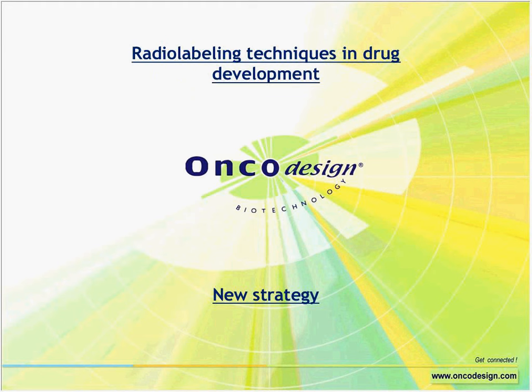So all the procedures I've shown are, I would say, dedicated to molecules that are already synthesized. And as they are already synthesized, the label will be linked, I would say, randomly in the molecule. And it would be interesting to have a method to label the molecule at specific loci.